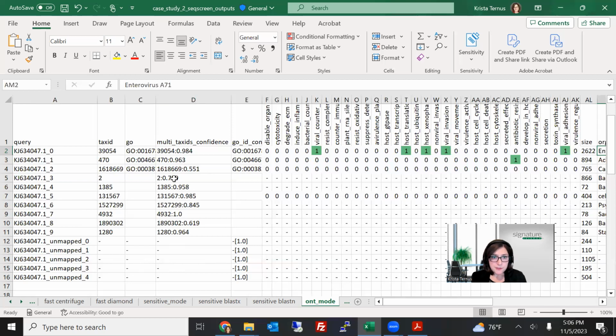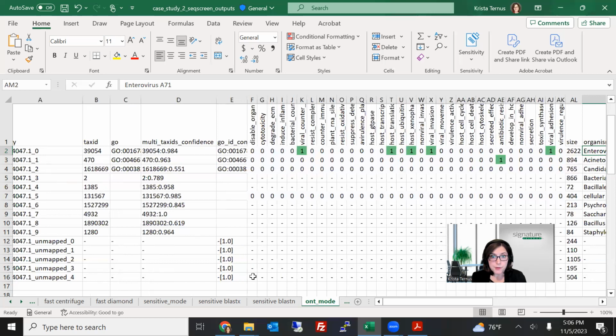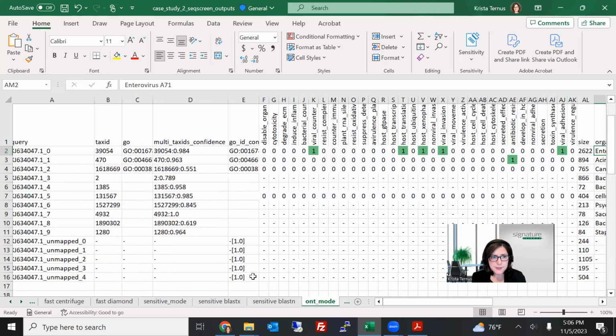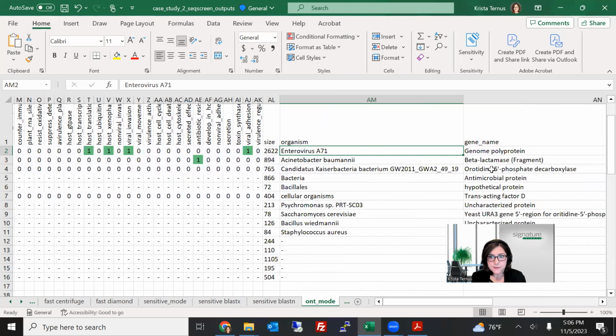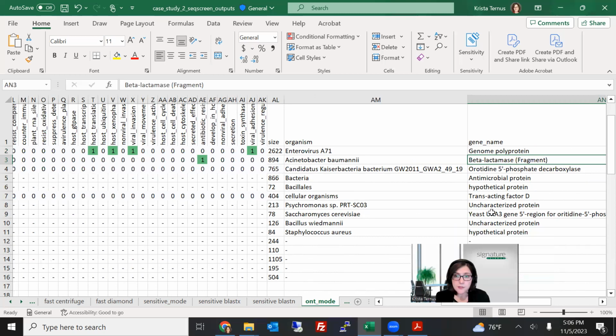And then we see a bunch of other stuff here in the ONT results, and that corresponds to other open reading frames that it's finding within this cloning vector. It's trying to decide what other genes are present within the cloning vector sequence that was provided. It thinks it has found some different antimicrobial genes, antibiotic resistance genes, and other genes involved in normal processes of cellular metabolism.